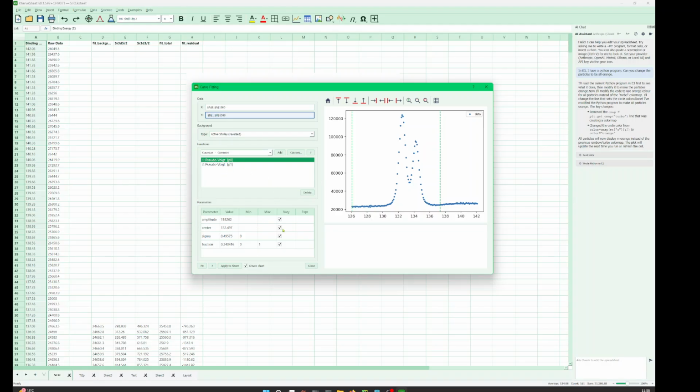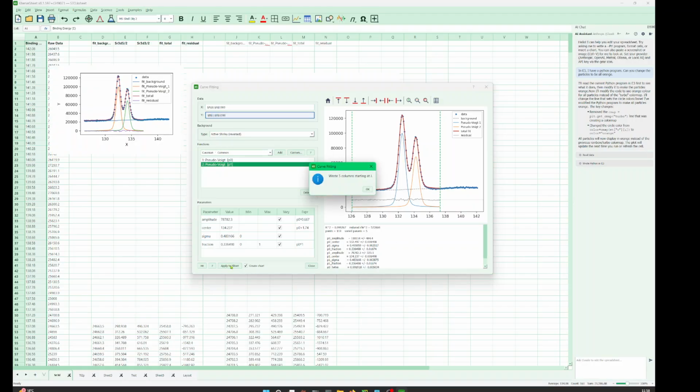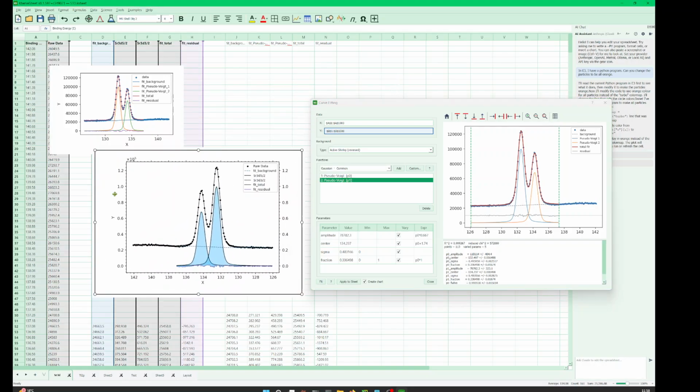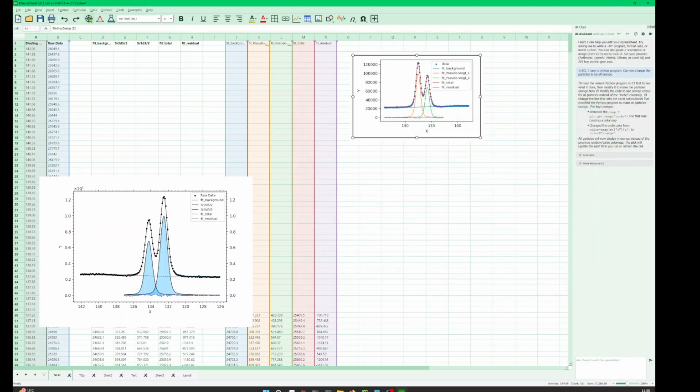And then I have this table, and if you go to pick 2, you can see that pick 1 is in function of pick 0 by this expression. And so when you fit, you get this data, it's nicely fitted, let's say. I mean, maybe something here not as good, but you can apply now and you get all this data now added, which is this belongs to that, this belongs to that. So again, something you could use, something that is not really on Excel. There's an equation solver here.